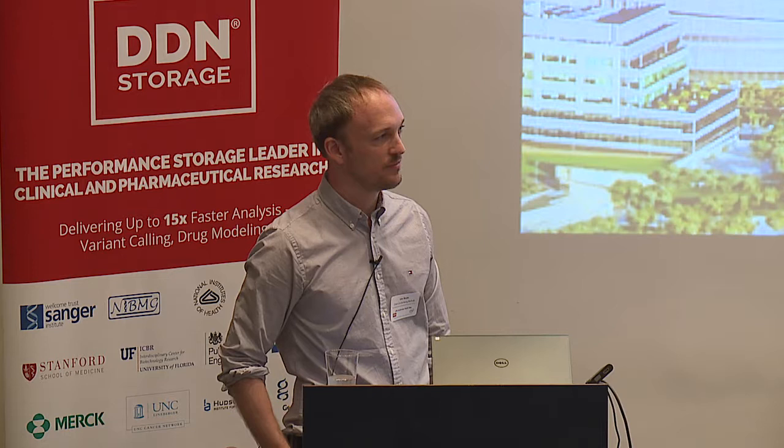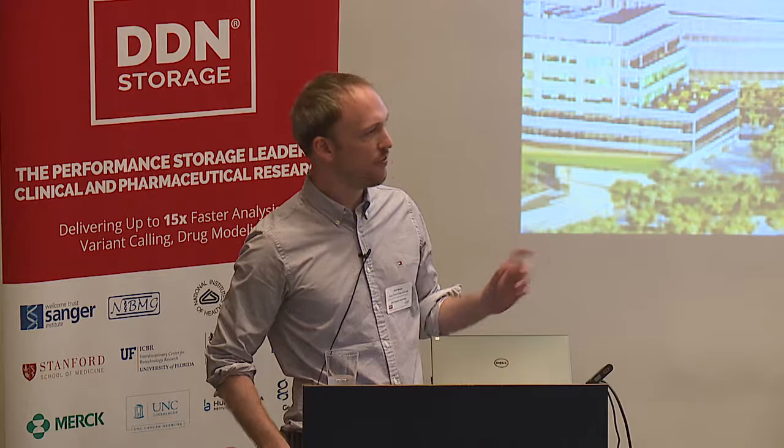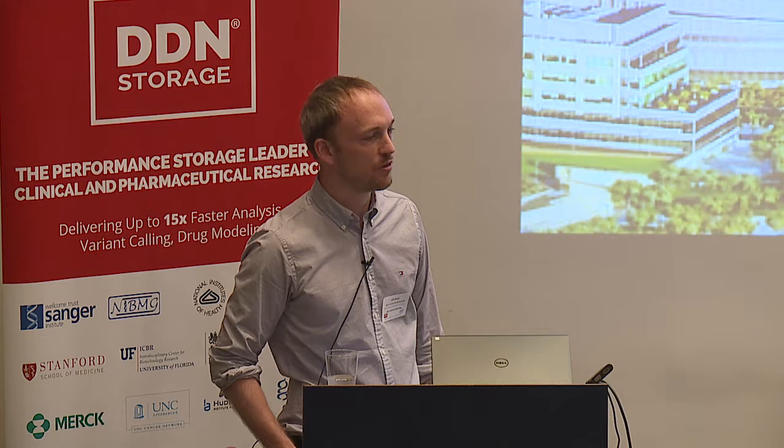I have a question along similar lines. How much time do you spend picking the most appropriate type of neural network for this type of imaging, or did you just pick one and go with it? I'm amazed at how much variation we can introduce and still get very reasonable results. It's pretty amazing, actually. You can make mistakes, but then they won't learn. But once you have understood the three or four things you have to make sure are present, as long as the key ingredients are there, you have a lot of freedom, and sometimes it doesn't make much difference in the quality of the result. They're extremely versatile and robust, in my experience. It's fairly stable to the type of network you use. Okay.